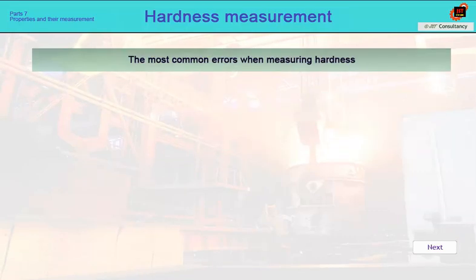And what are the most common errors when measuring hardness? Here is a list of them, but it is certainly not complete.